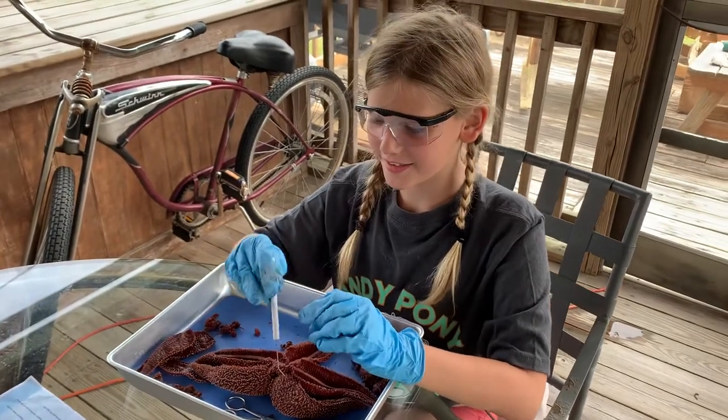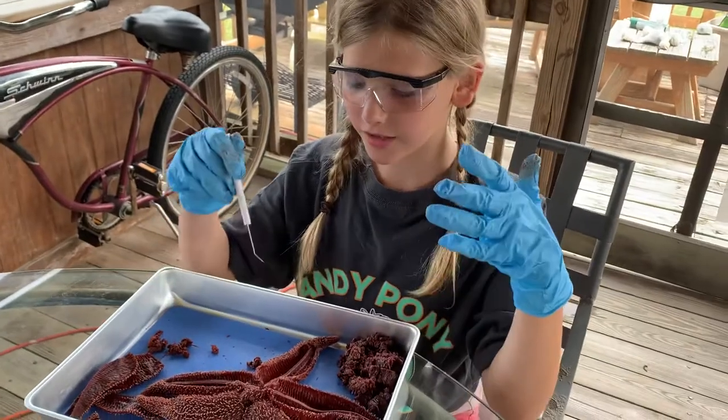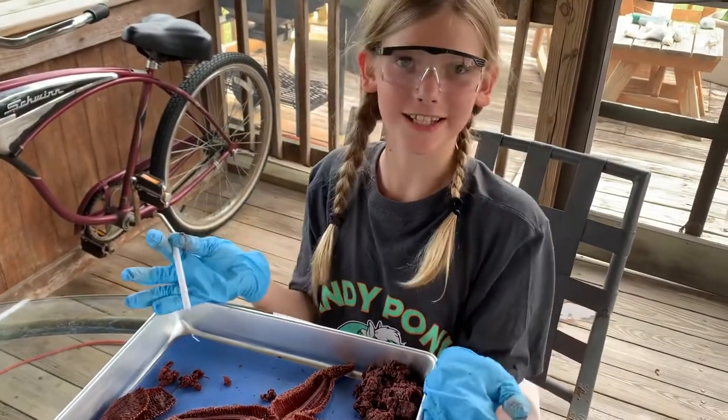Hi, this is Harper, and I will be doing a summary of my starfish dissection.